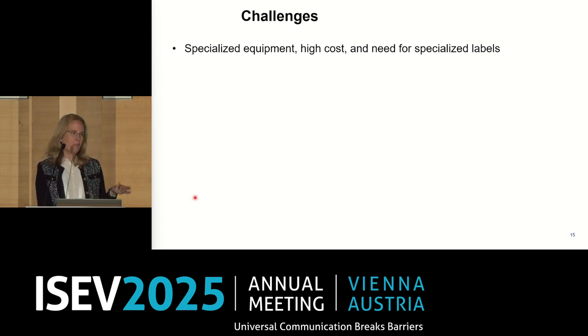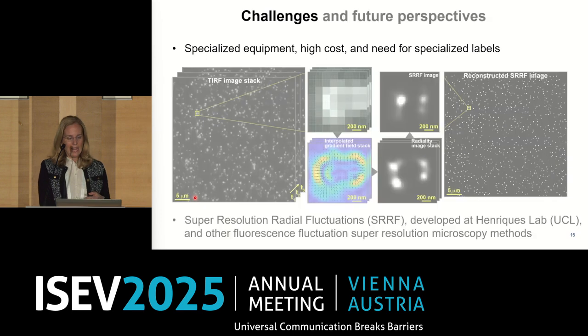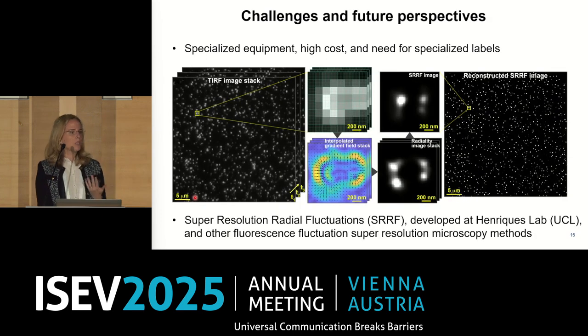Again, what are the challenges? Well, remember my students telling me that these fireworks are great but take too long, right? So it's time management. Often there is specialized equipment and a need for specialized labels. My collaborator says, hey, I have GFP containing vesicles, can you image them? Sorry, I need to use additional things. Things get complicated.